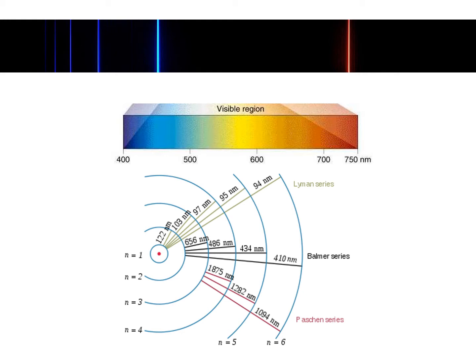Okay, so this at the top is an example for hydrogen. These are the colour lines that hydrogen will give off as it's progressively ionized and unionized and that kind of thing. Okay, so we can basically use the lines that we see to determine what chemical elements we have in our sample. Okay. And basically, the more intense the lines are, so the stronger the light coming off, the more of that element there is. That simple.